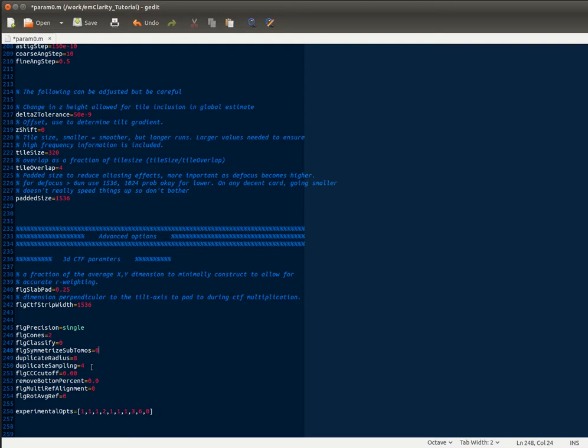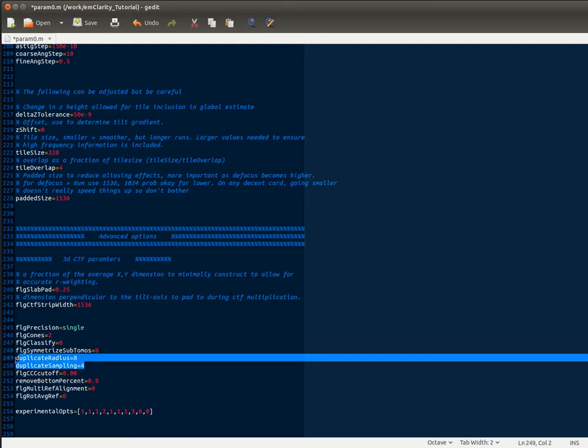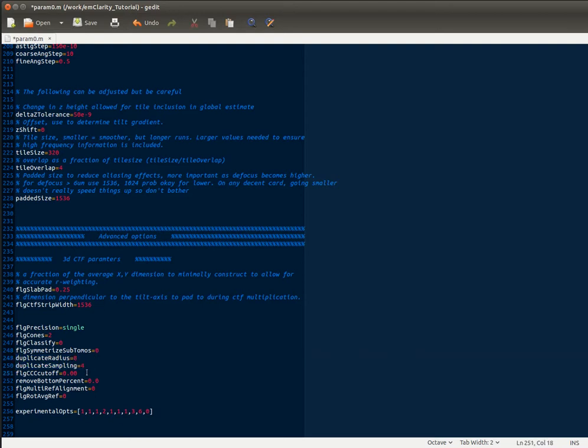We have the duplicate radius and sampling. I wouldn't change these too much. The sampling you could increase or decrease a little if you want. Same with the radius, but it basically is just the range that's searched to make sure that you haven't had some subvolume drift onto the position of another one, which would, of course, create some statistical interdependence between half sets.